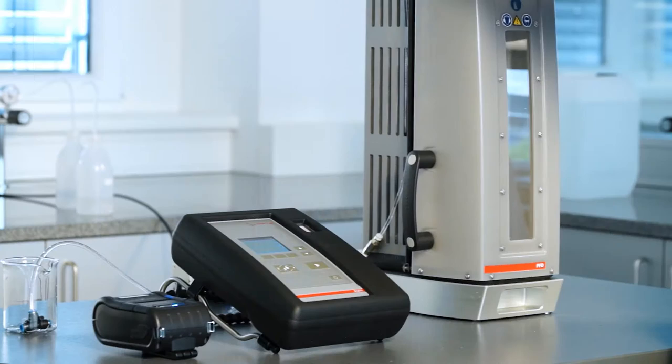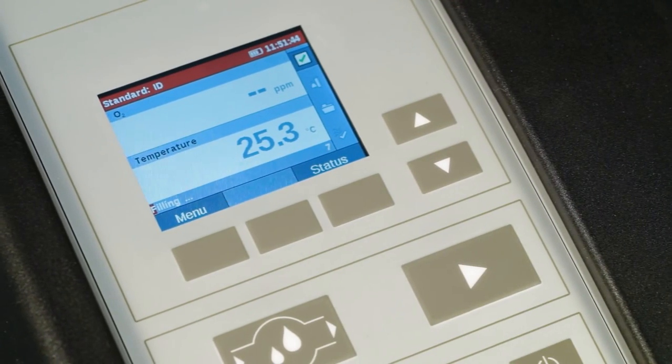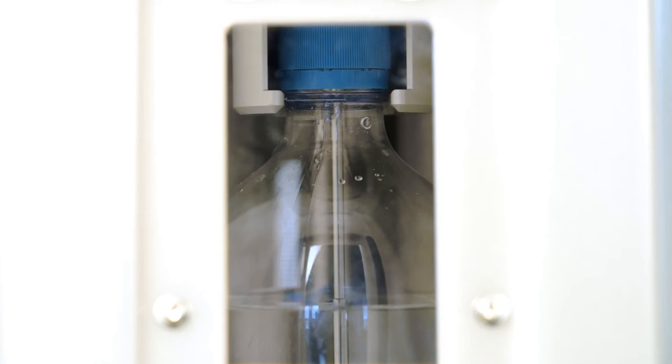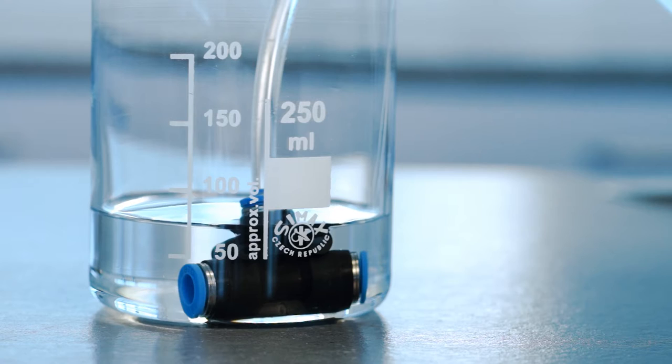With OxyQC Wide Range, a fast oxygen measurement is guaranteed. Your total measuring time is reduced to about 50 seconds, plus you only need a small amount of sample.